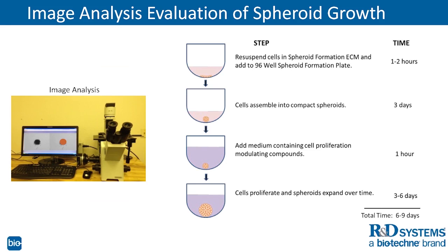Okay, and this slide is just somewhat of a summary with a timeline for spheroid formation. You see it takes 3 days for spheroid formation. This is a conservative value. Some lines will form spheroids faster. We find that we just keep this at a constant for all the lines we work with, and we have not had any problems.